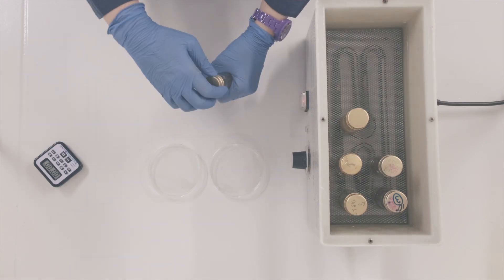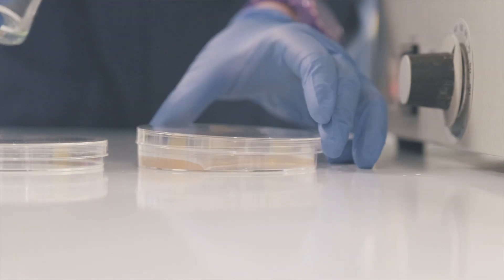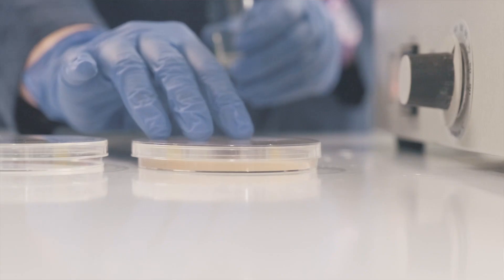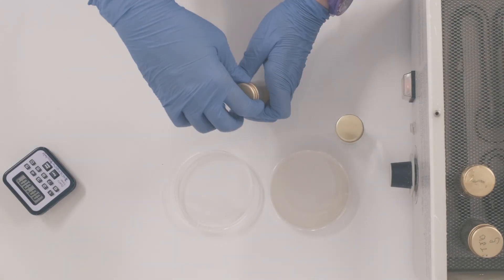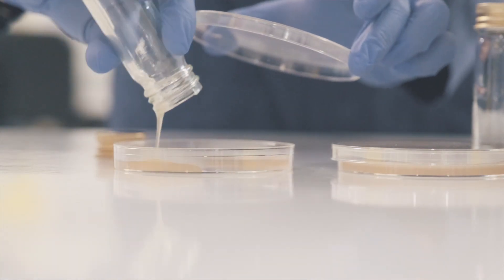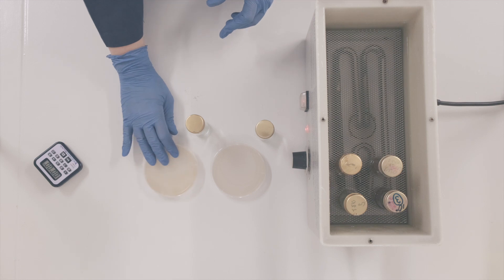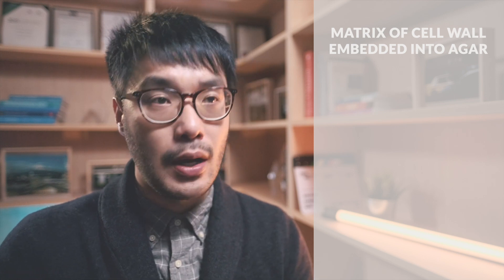Remove the agar deeps from the water bath and pour the liquid agar evenly out onto empty plates. Cover the plates, which will solidify at room temperature within 20 minutes.